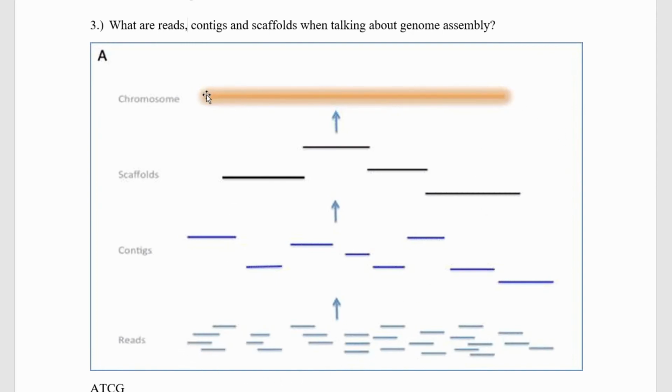So there's maybe a particular fragment of the DNA. Let's say this is like 150 base pairs long or something. And what they do is they make a bunch of different overlapping copies of sequenced information here. So these 4 reads are coding slightly different. This has more of the beginning part, here's more of the middle, here's more middle, and this is sort of the end. So these reads overlap in places.